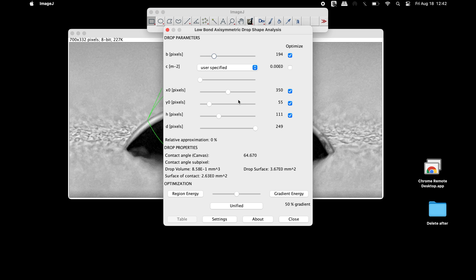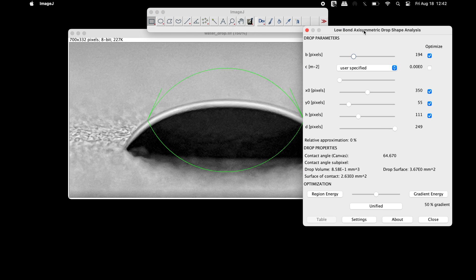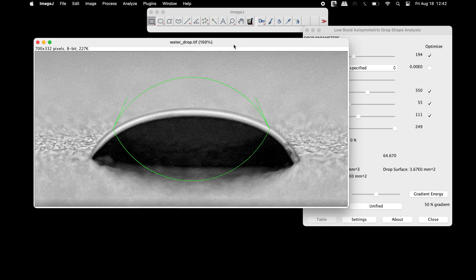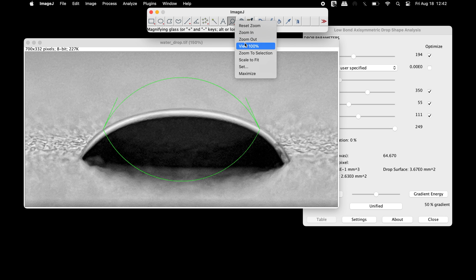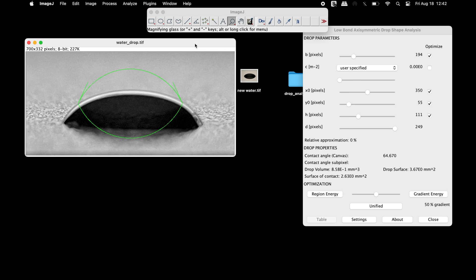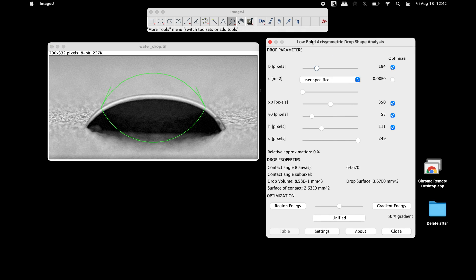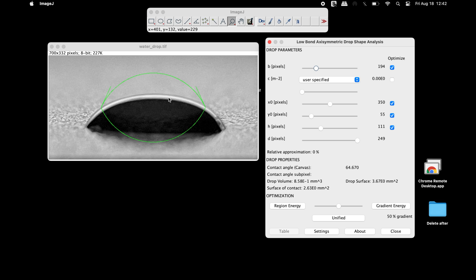The Low Bond Axisymmetric Drop Shape Analysis window will be used to perform the fitting for the water drop. The model is based on a first-order perturbation solution of the Laplace equation for axisymmetric drops. Contact angles based on a full drop profile shall be derived from the global drop model.